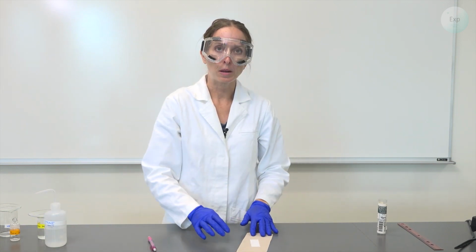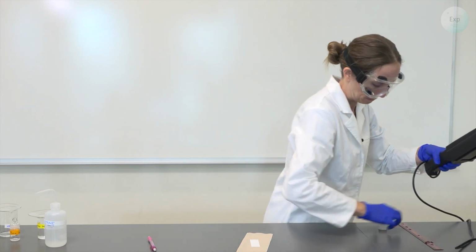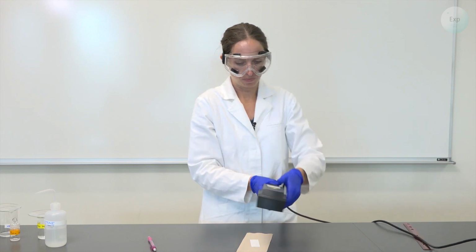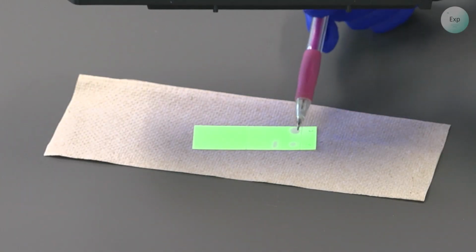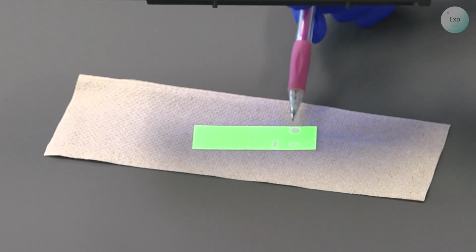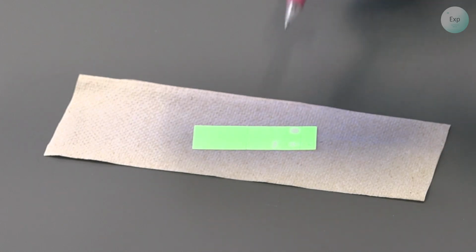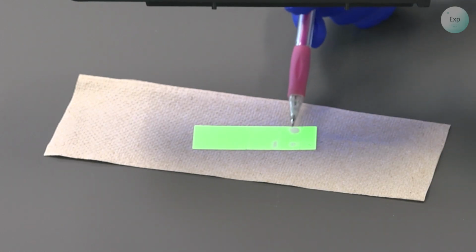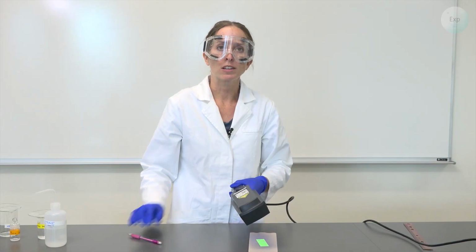Now I will use the UV lamp to see where the spots ended up. As you can see, a spot from our extraction is at the same height that is known to be caffeine. In our extraction, there is another spot there as well. So we did extract caffeine, but we can see from the TLC analysis that there is another compound there as well. We can move on to the next step in the purification.